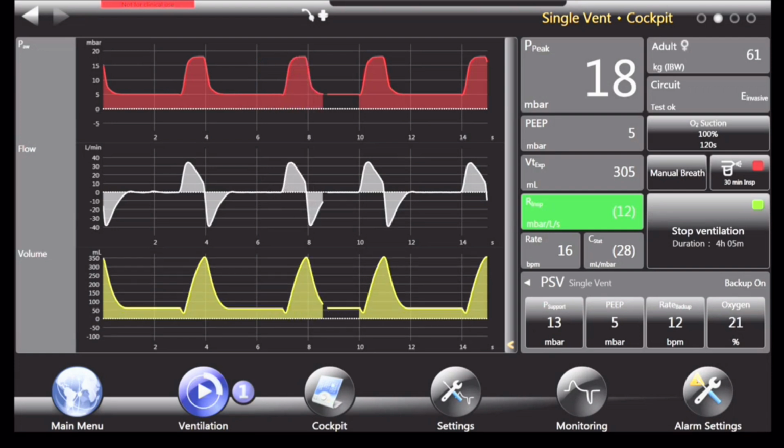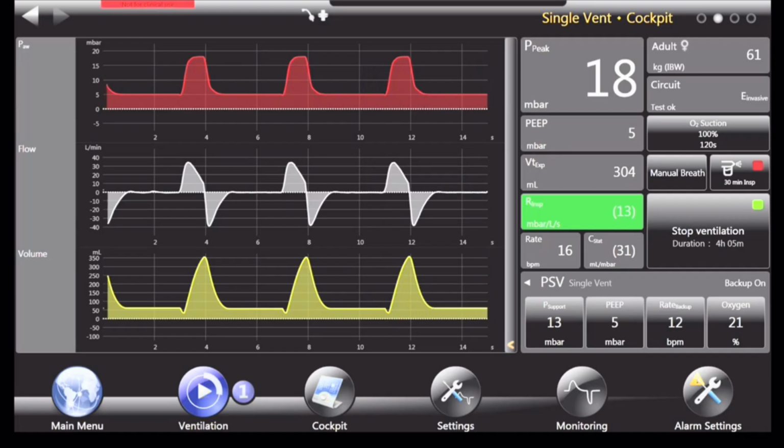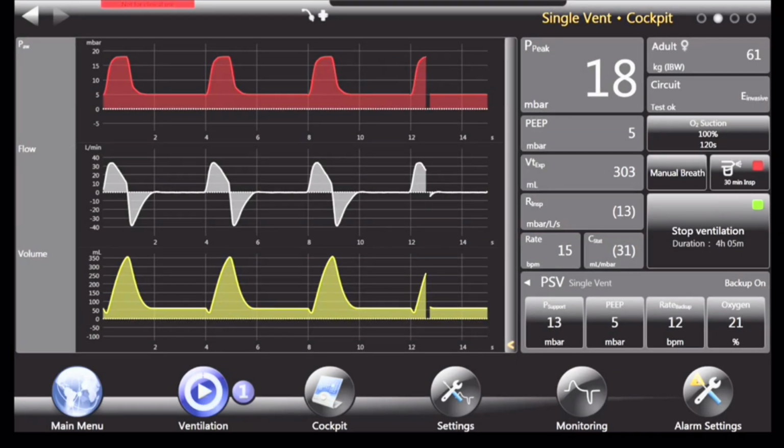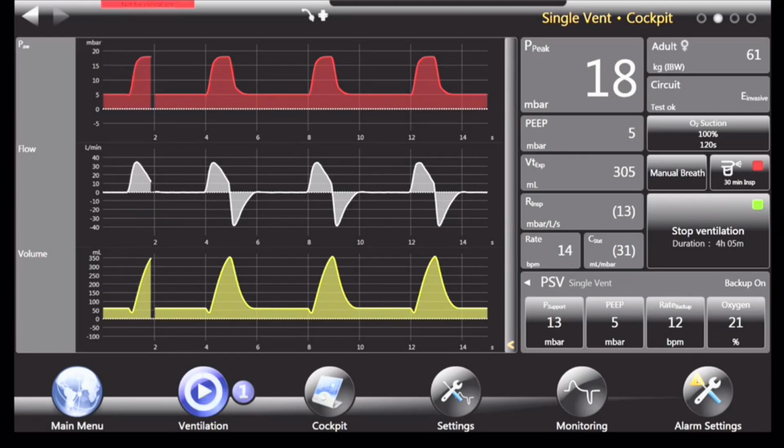And the tablet is currently displaying all this, but all these values you can see, and you will see in a few days, and we will also upload the final technical specification this week. They can also be taken out when you directly connect it to a PC over the interface.